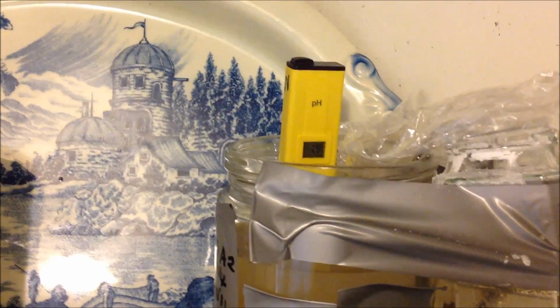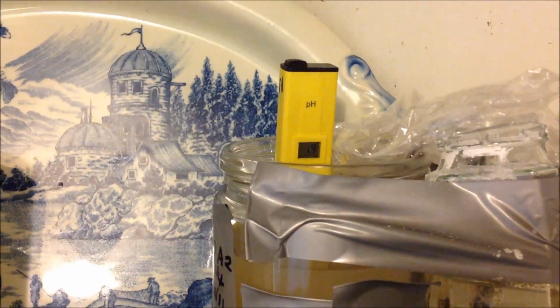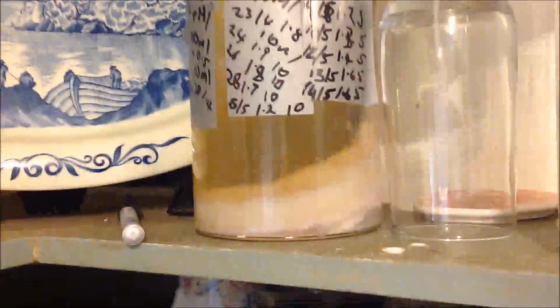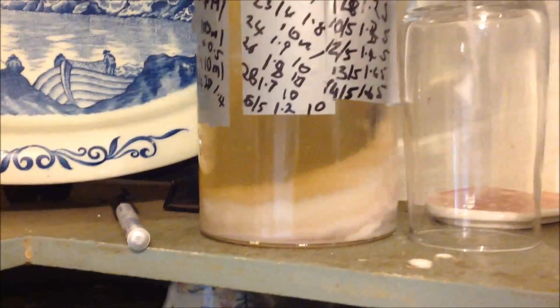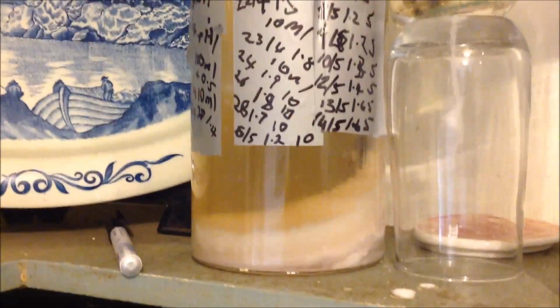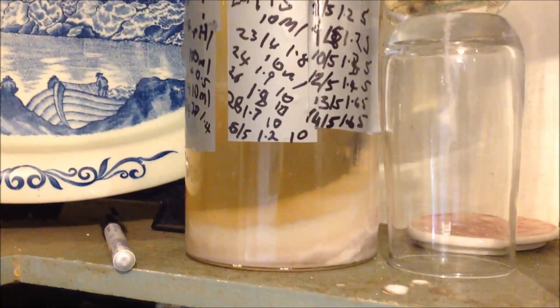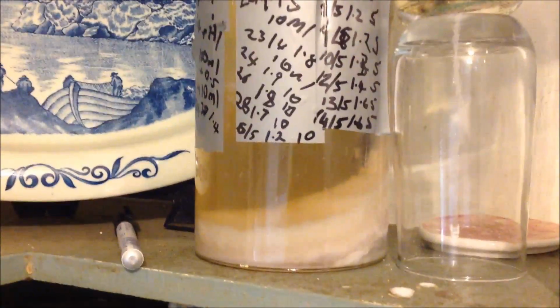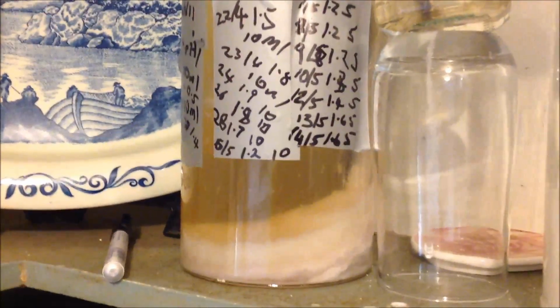We're still sitting at 1.8, I think that was, maybe that's sitting on 1.9 now, just stabilising at 1.9, and it's looking like way more precipitate than what I started with, so I can only assume that's just a greater volume, less dense. But push on, another 5 mil.